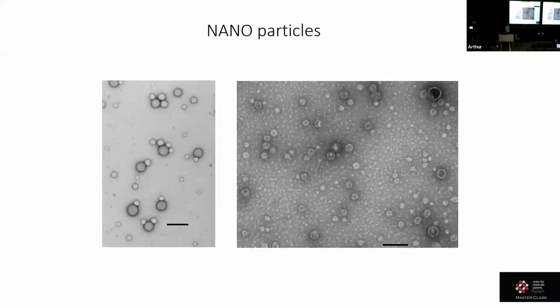We used to like carbon substrate sometimes. Carbon grids will cause this problem with background. What was the background? Carbon grids. Oh, they can cause this problem. Yeah, you're right. Sometimes you get that particular background. Yeah, that's good to know.